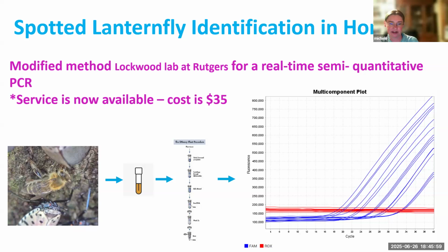So the method for this is very similar to the barcoding, and it uses the same PCR DNA photocopying technique, but there are some modifications. It's also faster. Usually when you give me one of these samples, I can run it within a week or two. What the method basically does, and I didn't develop this method, was developed by a group at Rutgers that actually designed it for wastewater, so they could environmentally track spotted lanternfly as it moved through New Jersey into Pennsylvania.